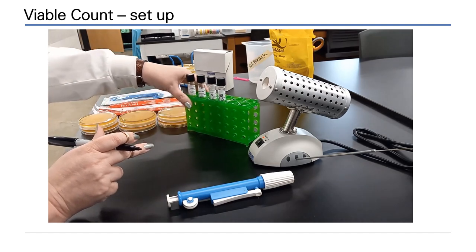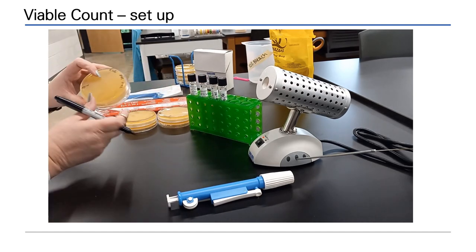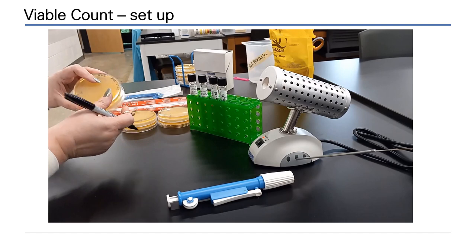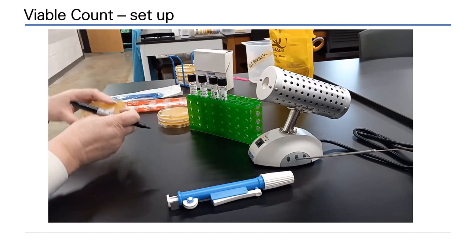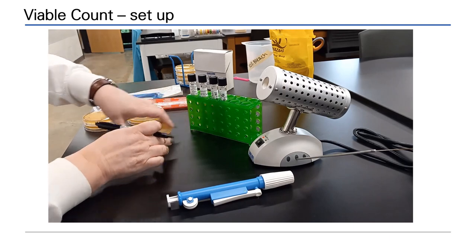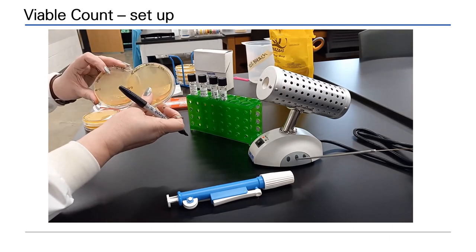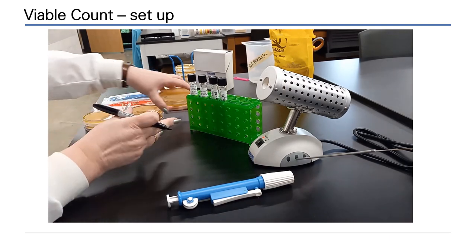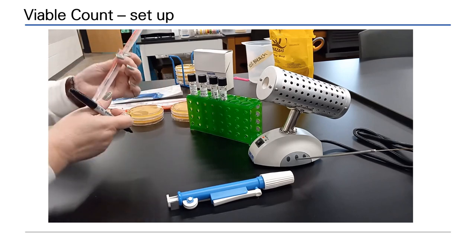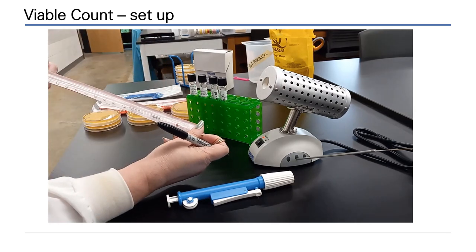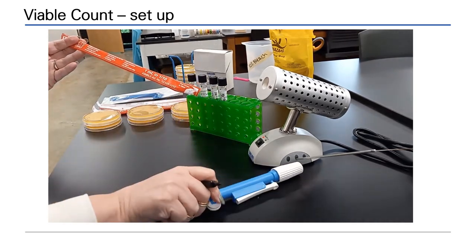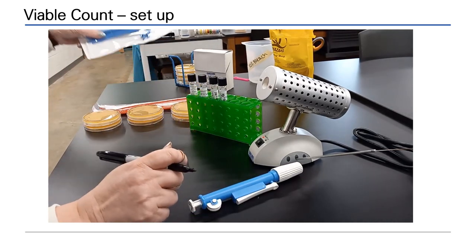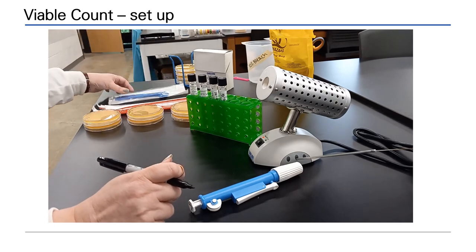Non-selective agar plates will be required at the end of the technique to plate the dilutions. Notice that each dilution has two plates. This will allow for accuracy in the determination of the viable count. You will also need serological pipettes and a pipette aid for the dilution. For the plating, we will need sterile spreaders.